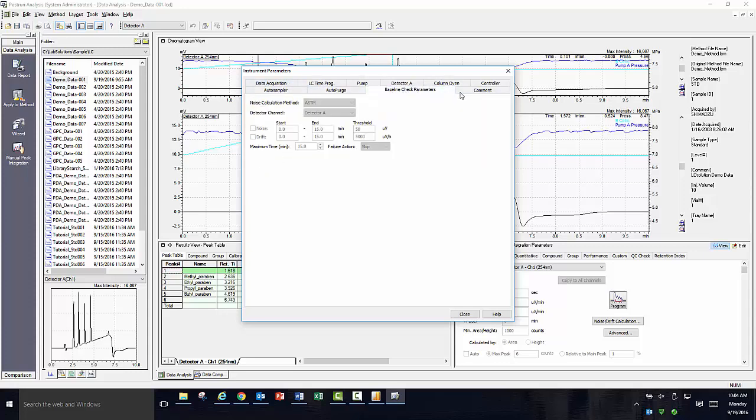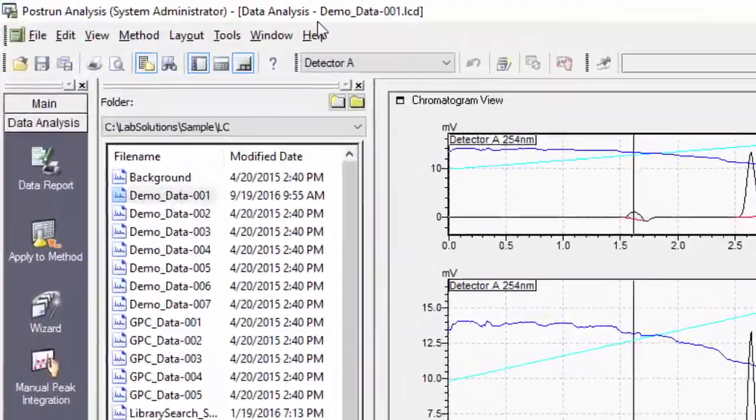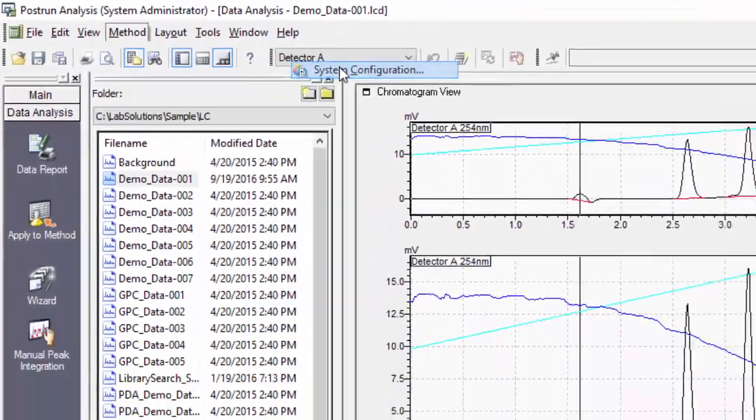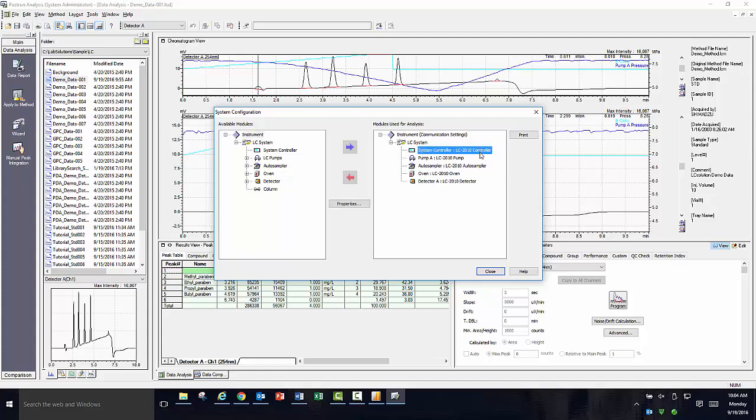In order to look at what hardware was used at the time of acquisition, once more, go up to method, data acquisition settings, and select system configuration. This will show you what instrument hardware was used at the time of acquisition.